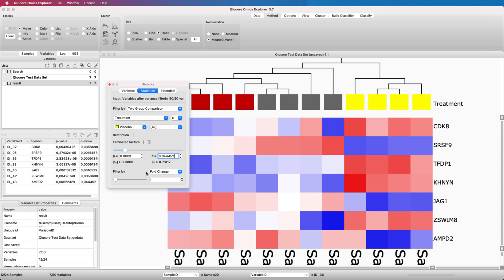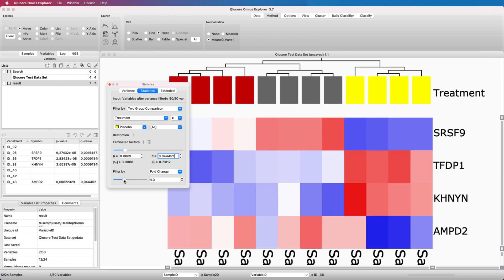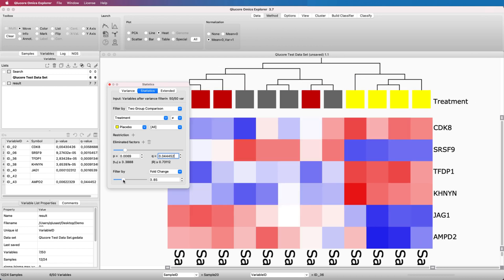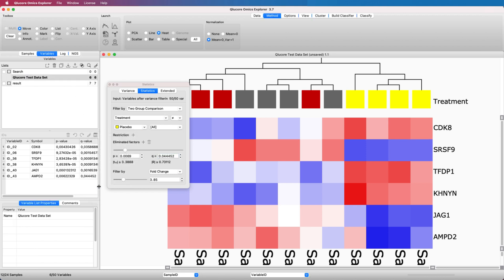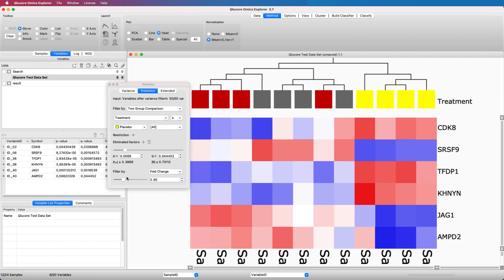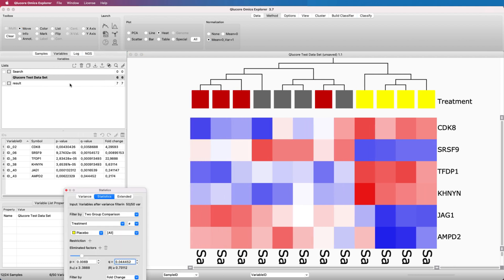Modifying the test is straightforward. Combine the t-test with a Fold Change filter by using the Fold Change slider. Add the Fold Change column to the active variable list and copy the list again and rename it.